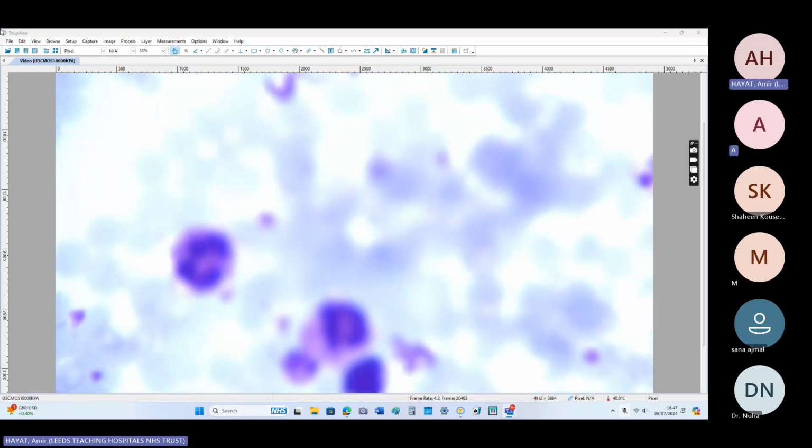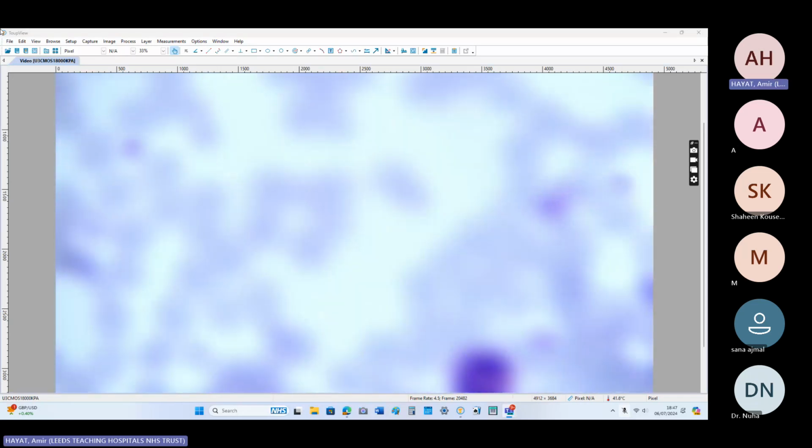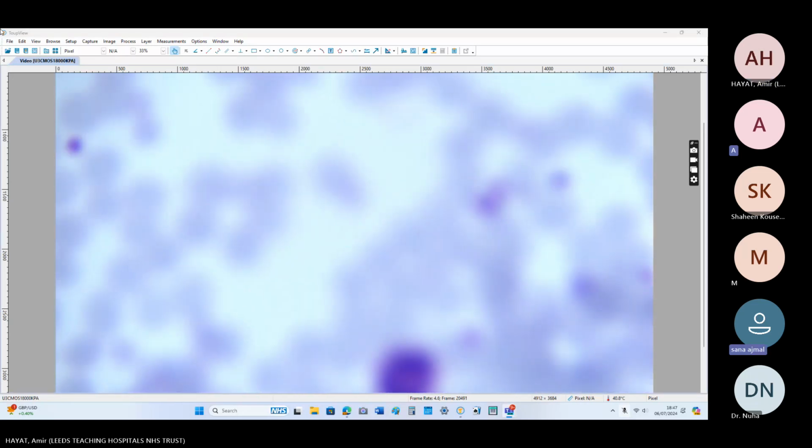This is Nika's slide. What was their answer, Cruzi or Brucey? Brucey. Very strange.